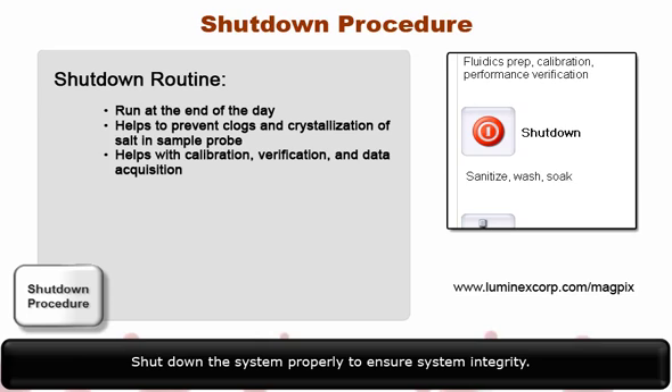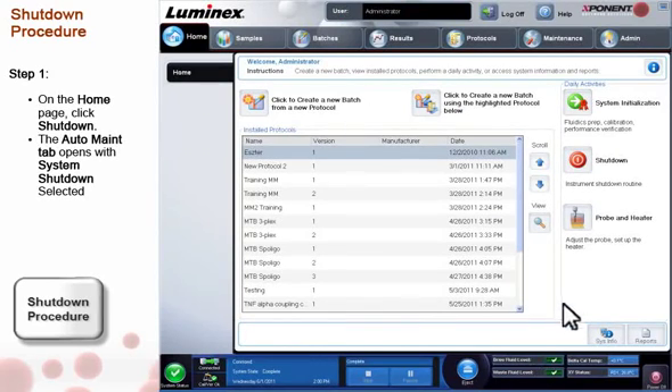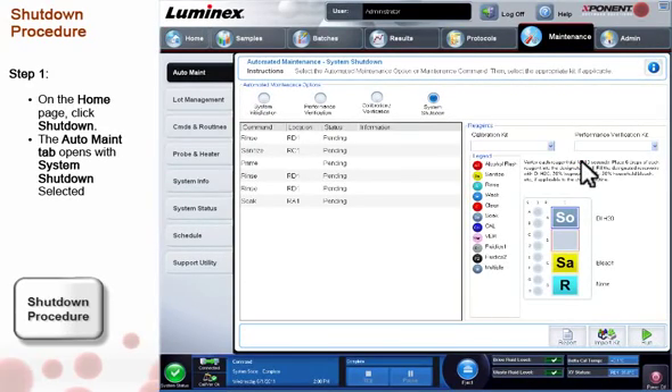Shut down the system properly to ensure system integrity. On the Home page, click Shutdown. The Auto Maintenance tab opens with System Shutdown selected.